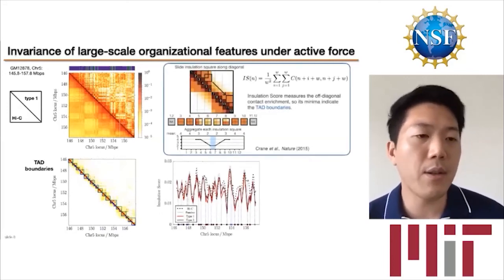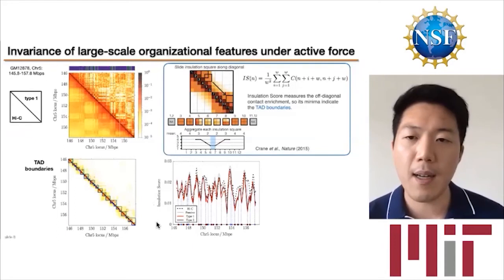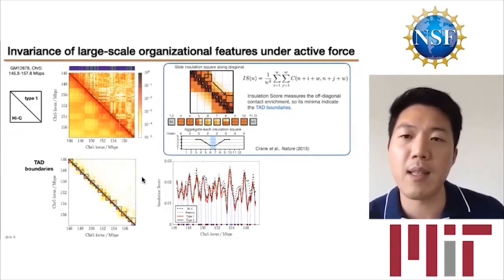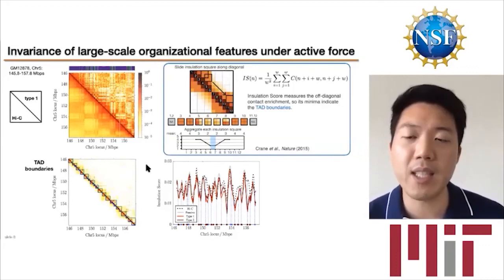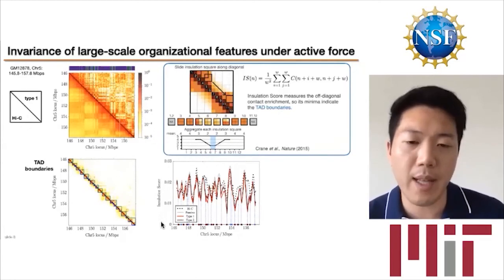In order to locate the TAD boundaries, we computed the insulation score as shown here. The insulation score basically measures the off-diagonal contact enrichment, so its minima will indicate the TAD boundaries. As shown in the plots, the insulation profiles overlap well with one another, which means the active force does not change the TAD boundaries much.